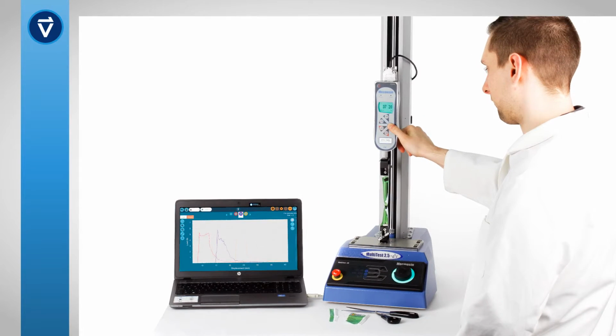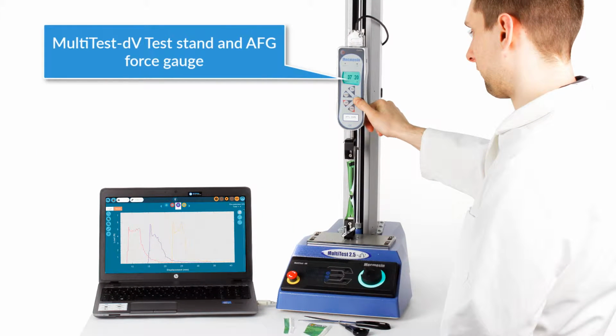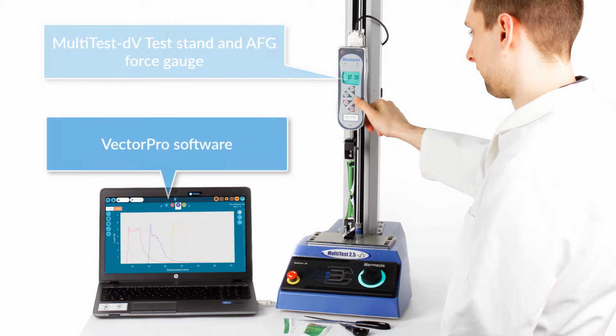Okay, so let's create a test. This will be a force test using a multi-test DV test stand and an AFG force gauge in conjunction with VectorPro Lite software.